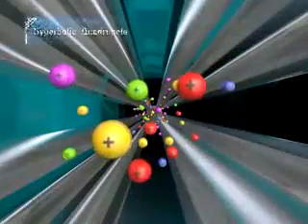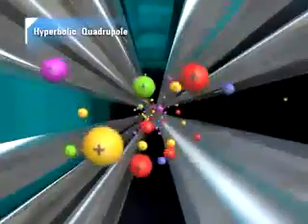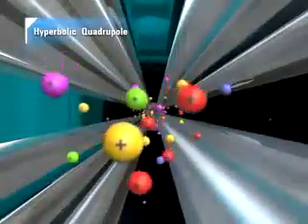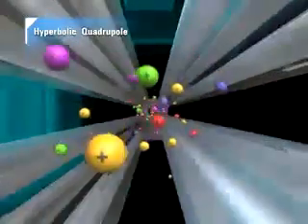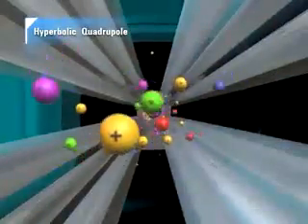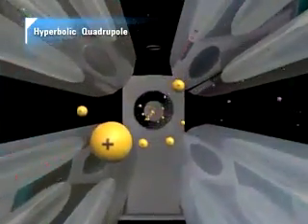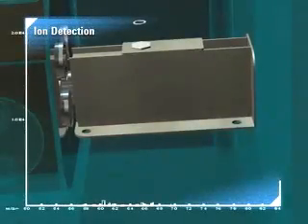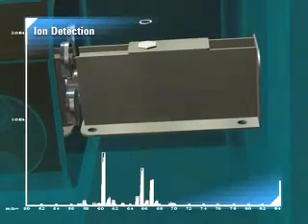The analyte ions leaving the ORS cell enter the quadrupole mass filter and are separated based on their mass to charge ratio. Only the target ion is stable and passes along the axis of the quadrupole. The quadrupole scans rapidly across the mass range and passes each mass of interest sequentially to the electron multiplier detector. Ions strike the detector, and the resulting electronic signals are processed by the detector electronics and stored in a multi-channel scaler, creating a mass spectrum where intensity at a given mass is proportional to concentration of the isotope at that mass.